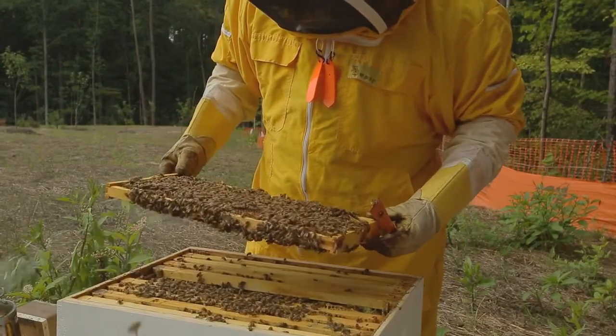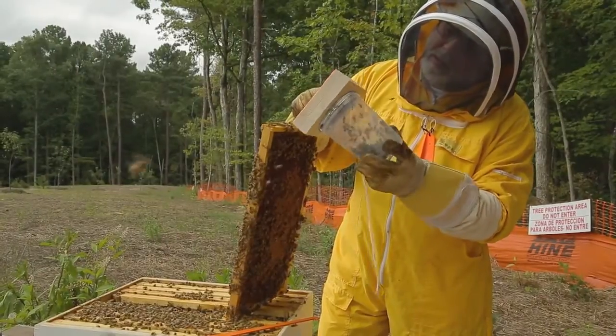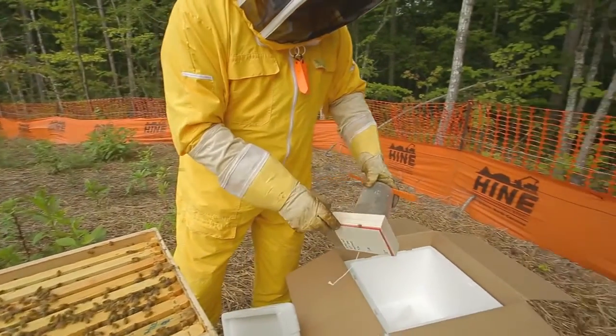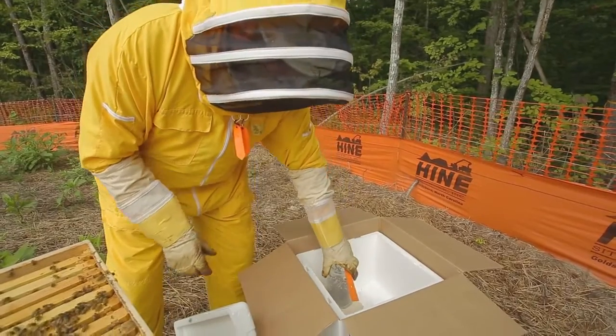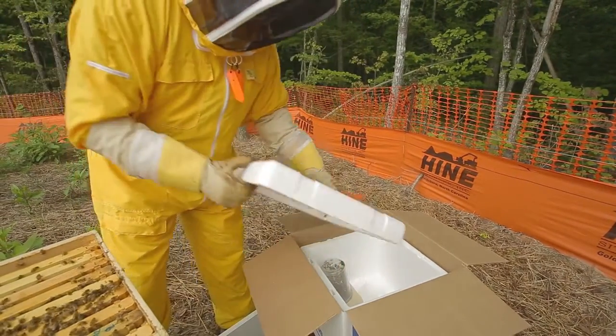We suggest collecting approximately 300 bees in a labeled container. This label should include the date, hive ID, apiary name, purpose of the sample, and your initials. Check the sample to make sure the queen was not collected, then put the sample in the cooler and transport to a freezer.